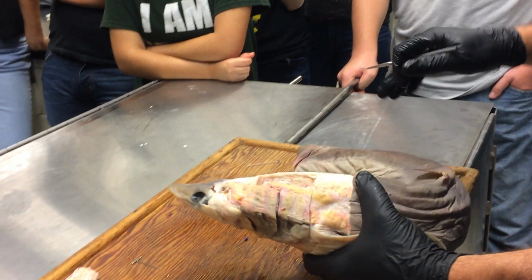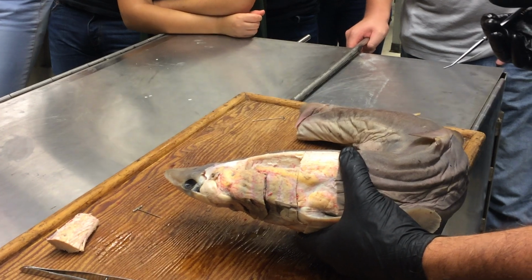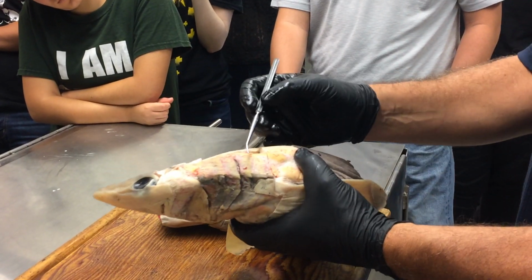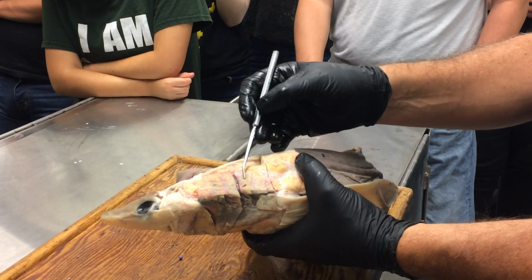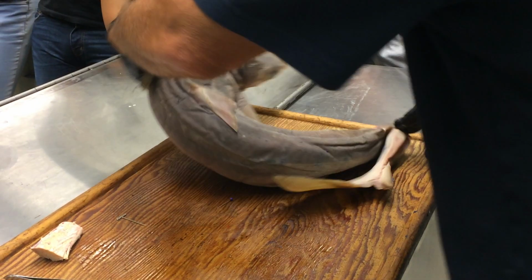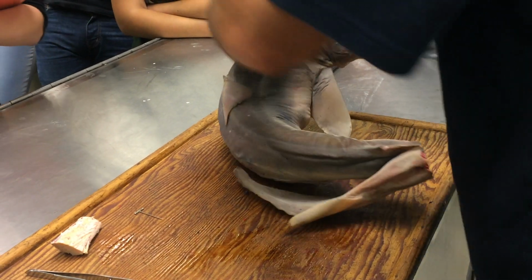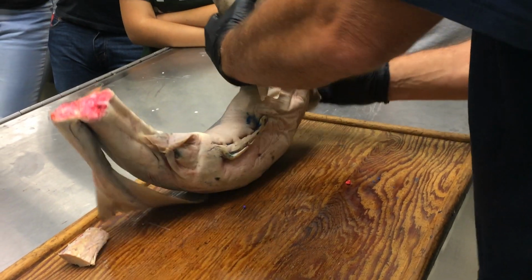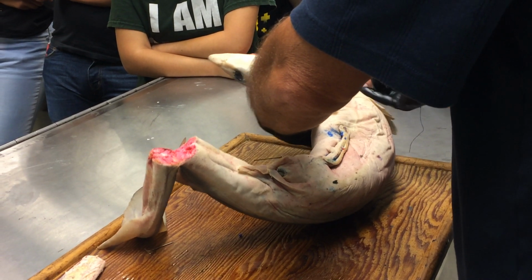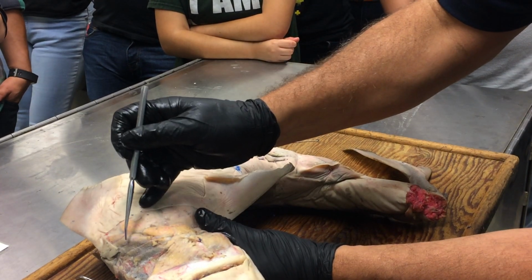So what are we? Okay, so that's it for the hyoid arch muscles. And then there's the branchial arch muscles. The branchial arch muscles include dorsal superficial branchial constrictors, which are this whole series of muscles here that, again, for some of you got a little torn up when you were skinning, but they're all here. And then there's also a whole series of ventral branchial constrictors that look similar, but on the ventral side. So all these guys here. The superficial ventral branchial constrictors, like that.